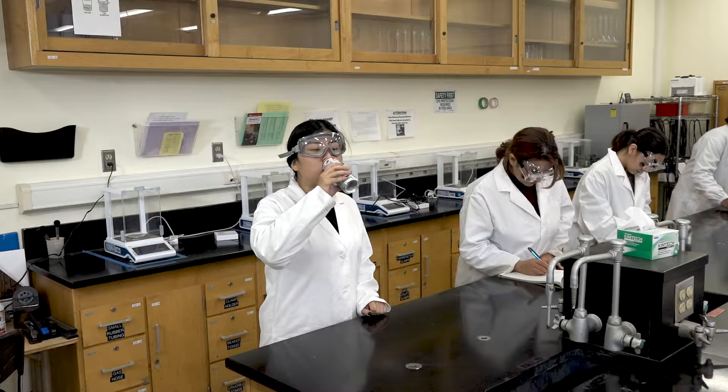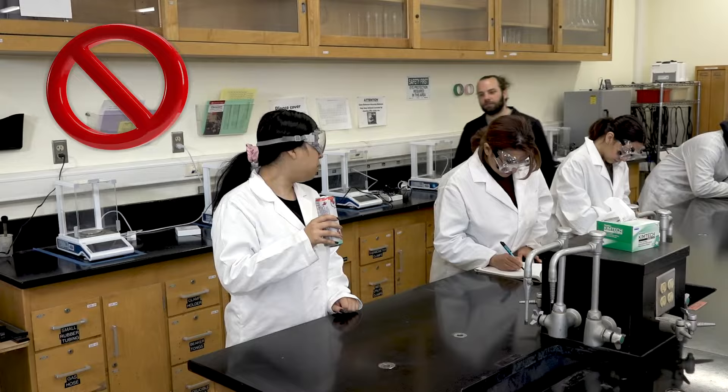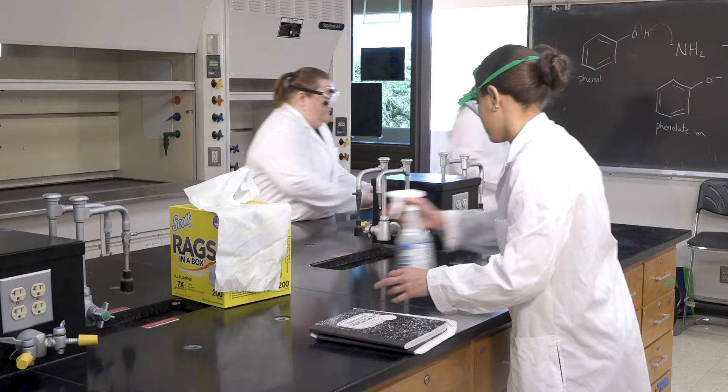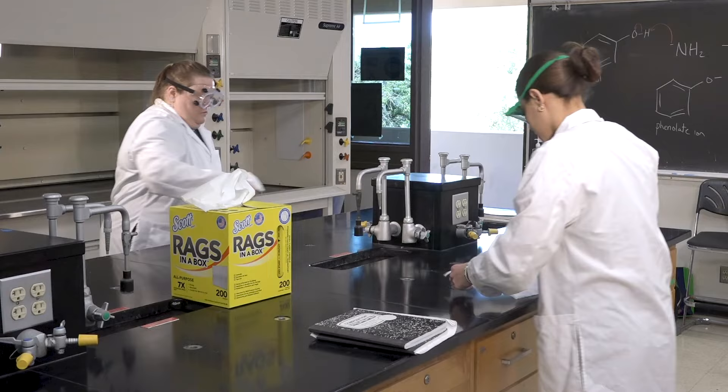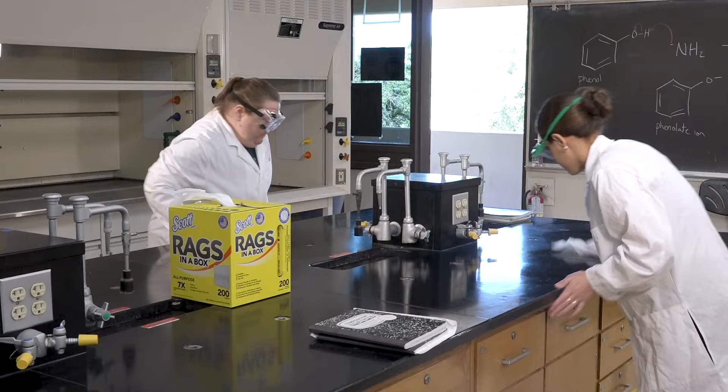For your safety, you want to assume all surfaces in the lab have been contaminated, so eating and drinking is never allowed in a laboratory. Surfaces can be contaminated with dangerous and toxic chemicals. While these chemicals might not be that bad for your skin, they can enter your system through eating or drinking, making them much more dangerous. If you want to take a drink of water during your lab period, please step outside to do so.